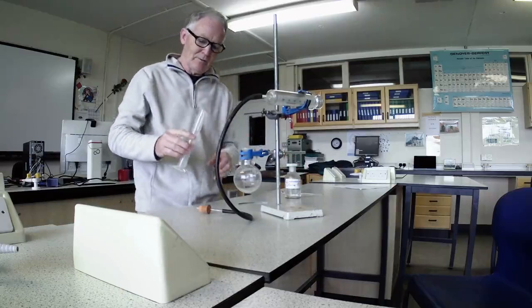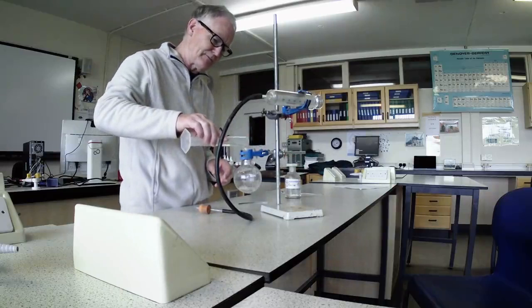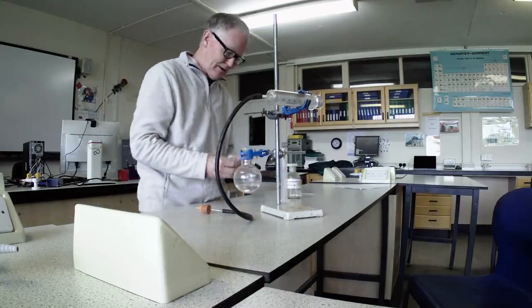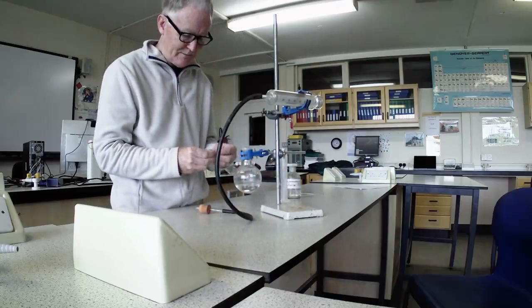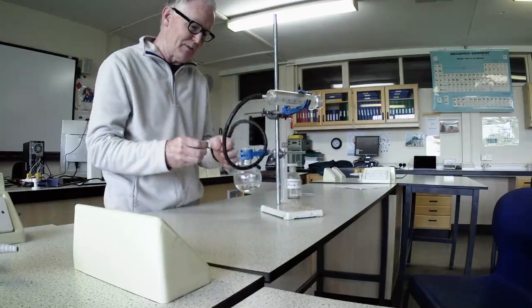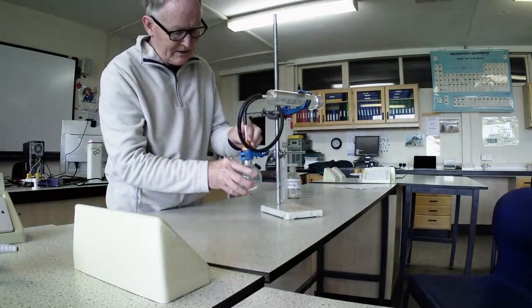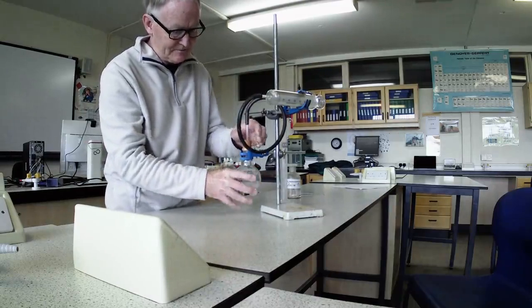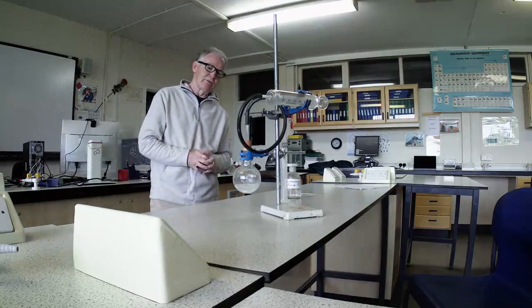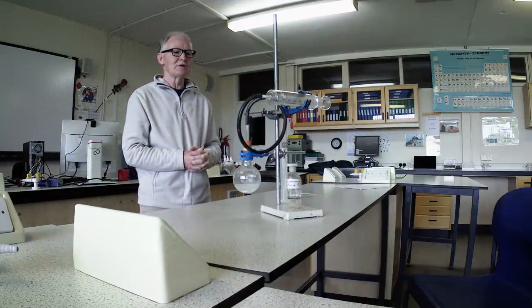So we add 50 millilitres of hydrochloric acid to the round bottom flask. And then this is just a piece of magnesium that we're going to drop in. So I'll get ready to catch as much gas as I can. So drop in the magnesium ribbon, stopper. And you can see the bubbles of gas that are forming there. You can see the plunger of the syringe is being driven out.